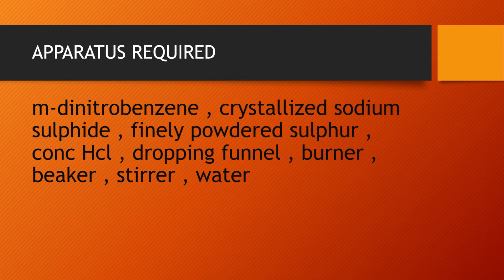The apparatus required are meta-dinitrobenzene, crystallized sodium sulfide, finely powdered sulfur, concentrated HCl, dropping funnel, burner, beaker, stirrer as well as water.